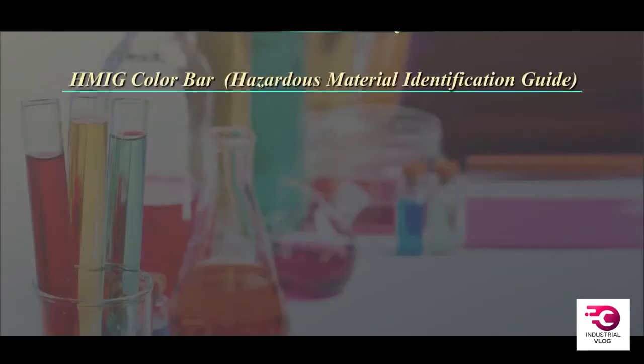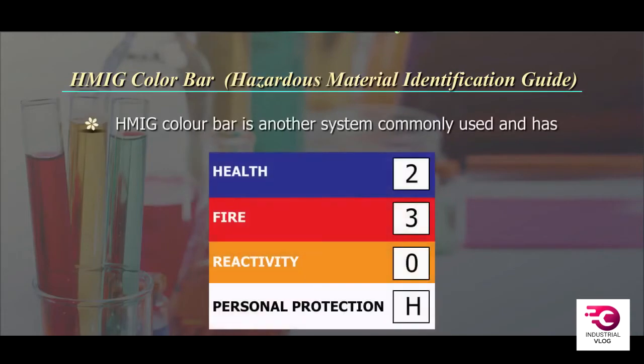HMIG Color Bar, or Hazardous Material Identification Guide. HMIG Color Bar is another system commonly used. It has blue for health, red for flammability, orange for physical hazard, that is reactivity, and white for personal protection. Fire and reactivity, both components of the physical hazards, are separate in this one.